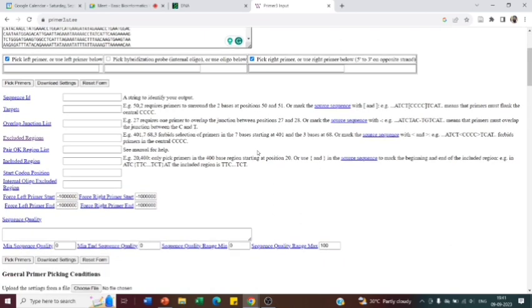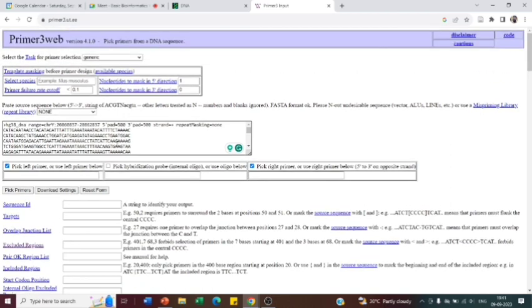Next, our sequence is about 1000 base pair only. Mostly Primer3 can pick the forward primer anywhere, here, and the reverse primer here. So we will not get our gene amplified properly. We will get some piece of DNA which belongs to the upstream overhang.